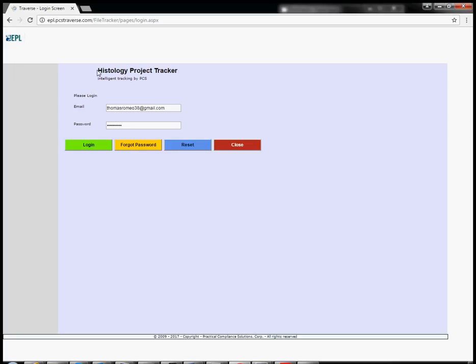As you can see, we changed the title on the main page to Histology Project Tracker. We can change that to anything we like. I mean, all of these titles are customizable. Obviously, we were able to put the company logo up there.